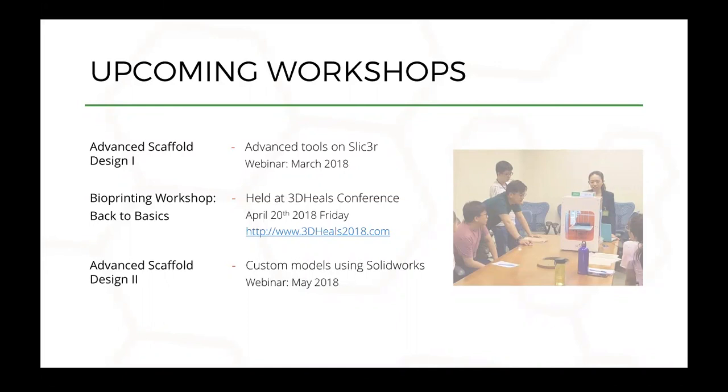Our Slicer settings have been tuned for our bioprinter, and different bioprinters on the market will have their own Slicer settings. That's where the R&D, iterations and engineering really go in. In the next scaffold design webinar, we plan to talk more about these tools in Slicer. And if you have different needle tip sizes that you want to print with, we will also talk about what adjustments you will need to make on the Slicer settings to do that.